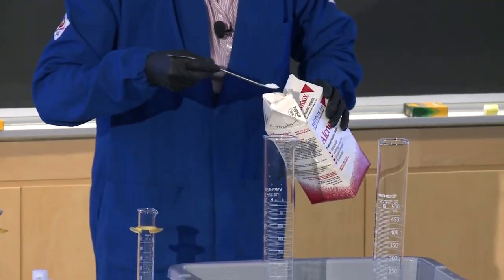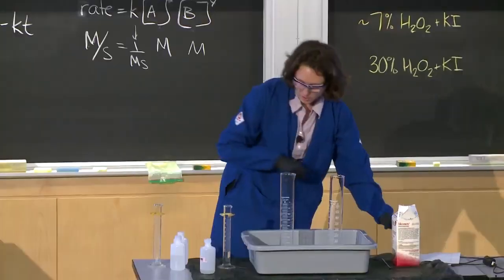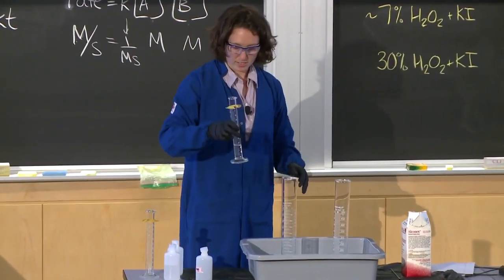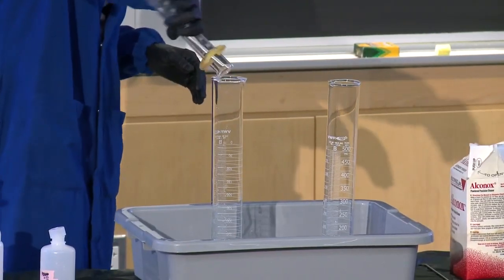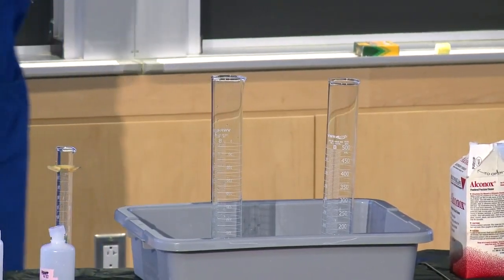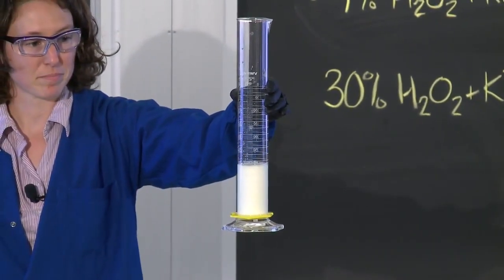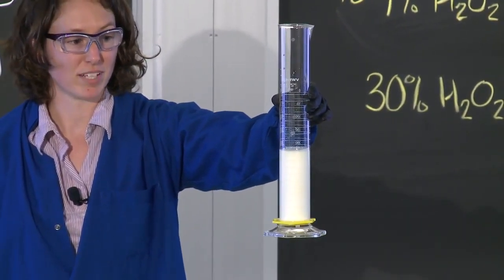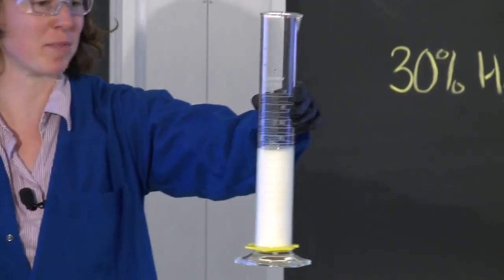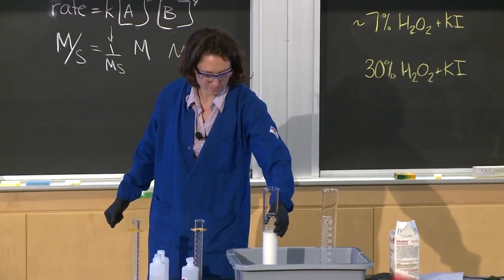This is just powdered soap, and we can add a couple of scoops of that. And now, hopefully, if all goes well, when I add these together, we will see the decomposition of hydrogen peroxide. I can probably hold it up so you can see what's happening. So what's happening in there? It's bubbling. Good. Excellent. So what are the bubbles? Oxygen.